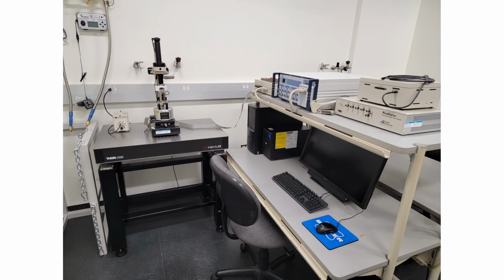Here's the new AFM station currently set up in the new science complex at the Towson campus. This is where the majority of my work's been done. There are 3 AFMs in the AFM lab, but this is the current one that I've used, a Bruker instrument, and it has the capability of taking large area scans.